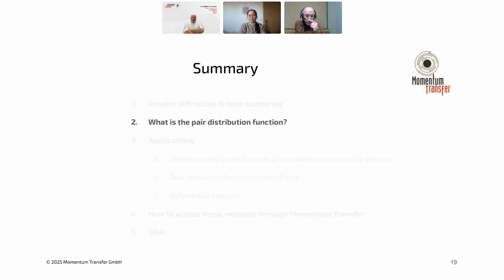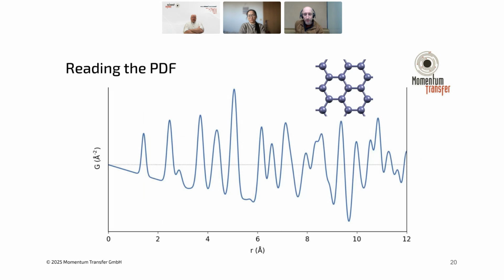Okay, so what is the pair distribution function? Again, there's a lot more that goes into deriving everything between these, and we'll do another discussion on how to do PDF in 2 weeks, so I will get a little bit more into that in that session. But here I just want to give you a brief primer on how to read the PDF, so that when we get into the applications later, you know what you're looking at.